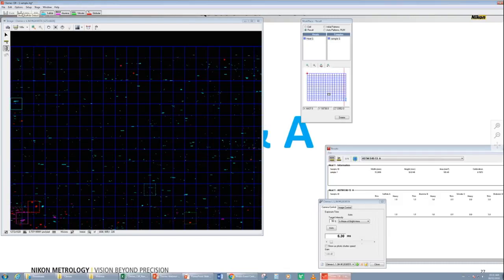As we saw, the sulfides are lighter and the oxides are darker. Then oxides are divided into three other inclusions. In the case of ASTM, we have alumina, silicate, and globular. Those are divided by their shape. Alumina are rough, silicates are smooth, and globulars are round.